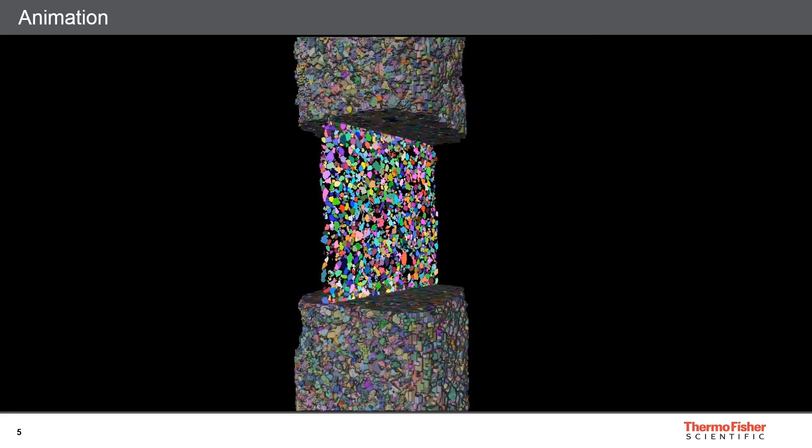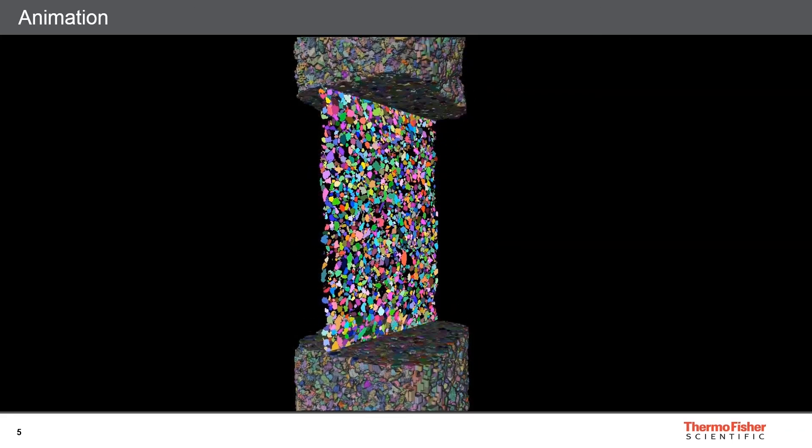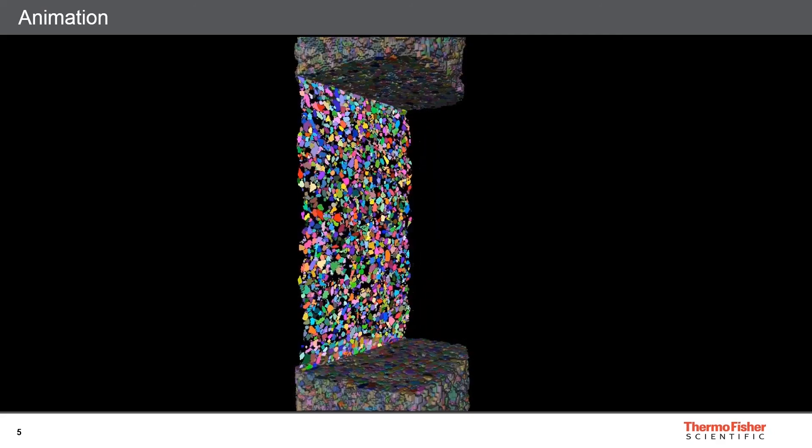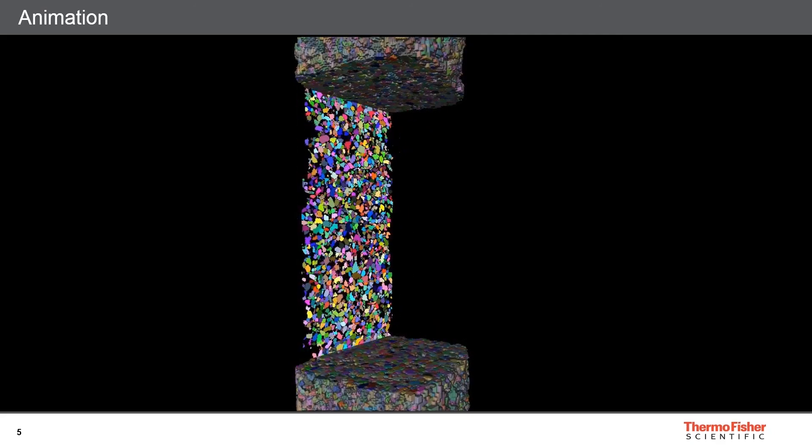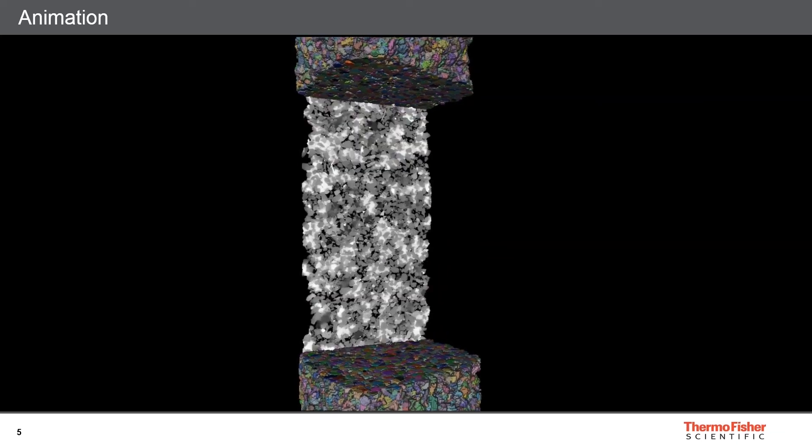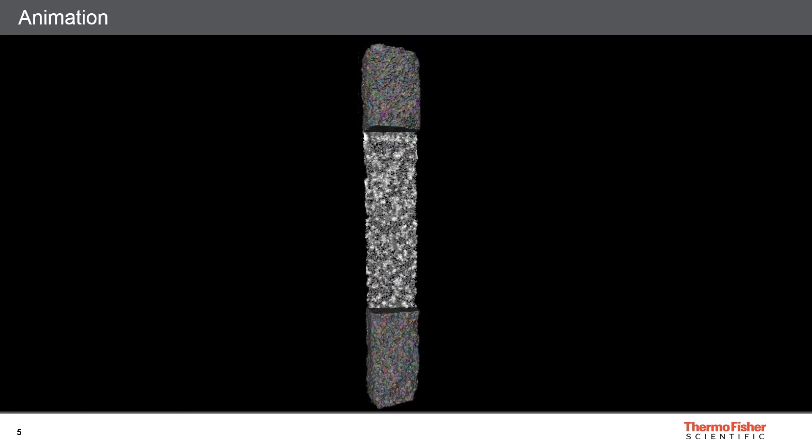Just so you know, this video has been generated on my laptop, which has only 32 gigabytes of memory. So again, this is, if we look only at the visualization, this is a very nice feature of Pergeos to be able to visualize such a big amount of data.